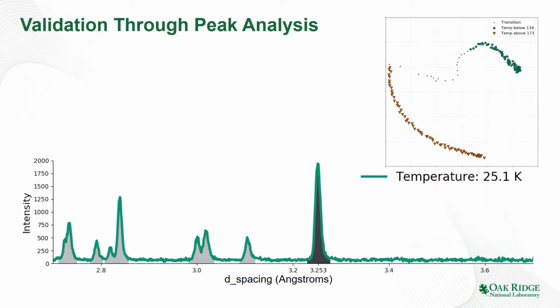I'll now demonstrate how effective the clustering was by showing the intensity curve for each temperature and identifying peaks. As the temperature starts to increase, pay attention to the darkest peak and its center. We'll observe the peak shrink, split into a triple peak actually, and then it will recombine as it all moves slightly to the right. So here the temperatures are increasing, and we're all in the cool region now. The color corresponds to the cluster that we're in.